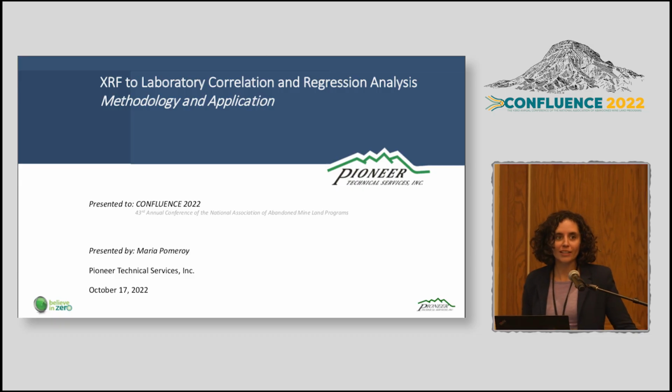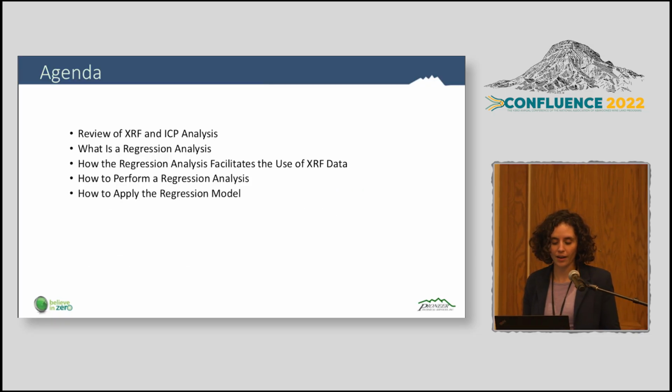Okay, so our agenda for this presentation, we're just going to go over real quick XRF and ICP, which is the laboratory analytical methods. We'll review quickly what a regression analysis is, and then talk about how a regression analysis facilitates the use of XRF data, and then get into the meat of how to perform a regression analysis and how to apply the regression model once we have one.